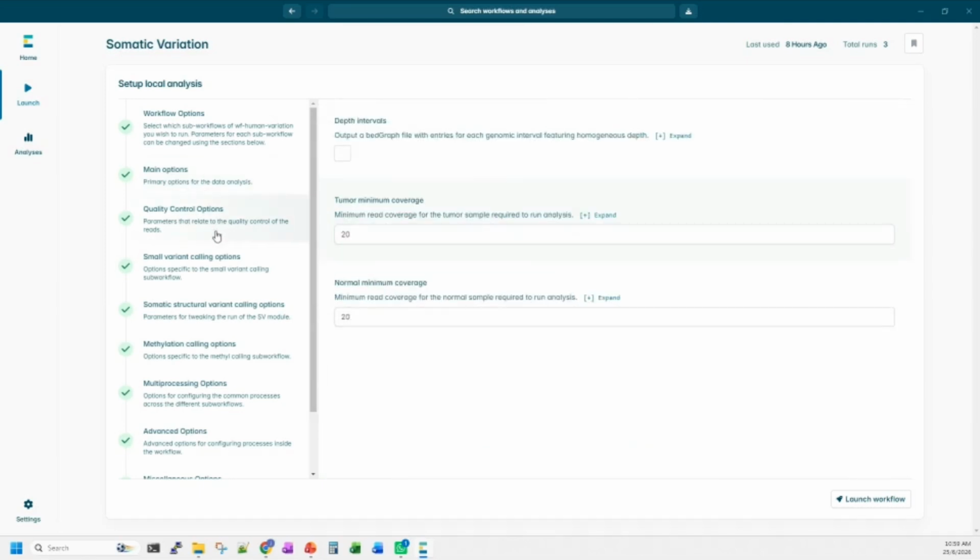The next one, quality control. Because I'm using a very small data set, I'm going to set it to 0. So this one, it will try to only analyze the bases when it achieves certain coverage. So if let's say our data throughput is very low, we might need to set it all the way to 0 or 1. And then because supposedly for a tumor sample, we should be sequencing or getting 60x coverage, this one we can also adjust accordingly. And then because I do not supply normal samples, I'm going to leave it as it is.